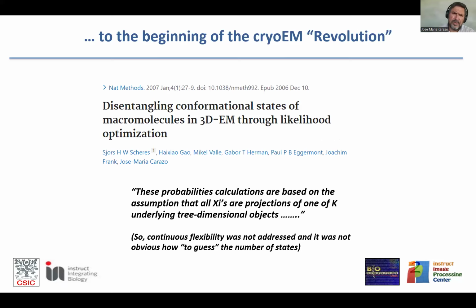We were able to simultaneously find the relative orientation between the particles and classify the different macromolecules into different states.